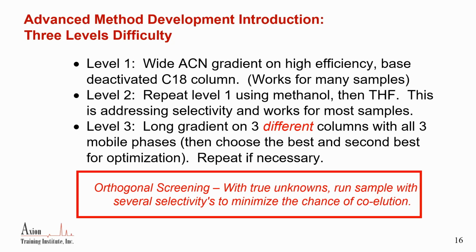no selectivity, you're at the bottom of the valley. You know, anything you do has got to be better. Then we get to level 3 of method development, and that's what we're about to enter. And that to me says, you've tried all the simple stuff, you've tried all the different solvents, and it still doesn't work, time to change the stationary phase.